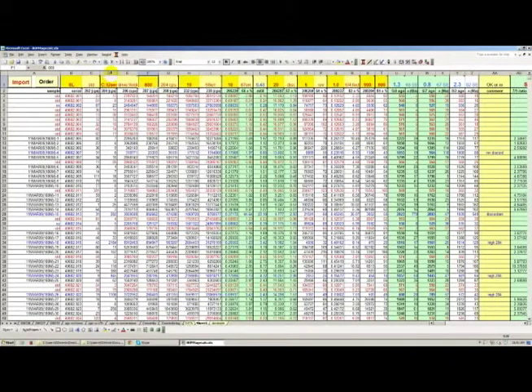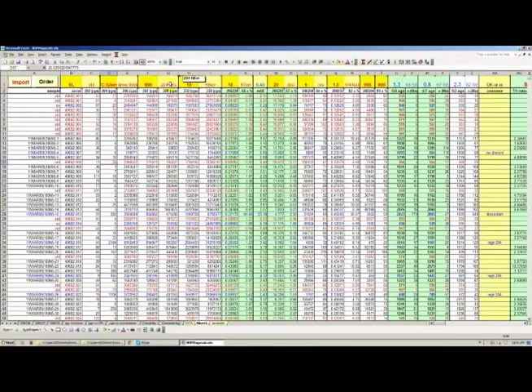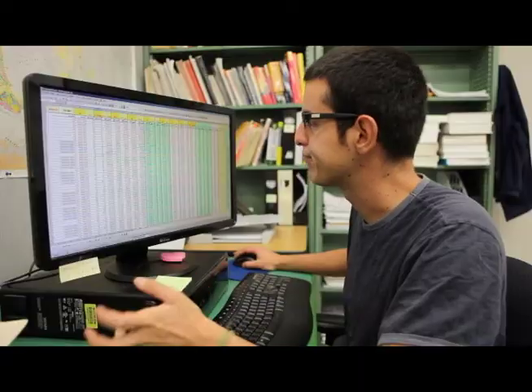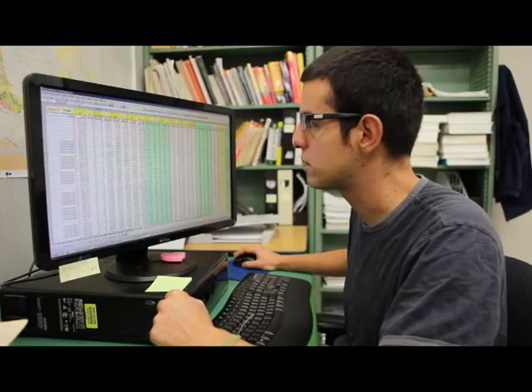And you can see down here, if you look at column D, that these values are usually pretty low. So in most zircons, and especially if you look at your Sri Lanka standards, you'll see that they average 10, 20, and for the most part they stay pretty low also in the unknowns. But then every now and then there are some grains that have a significantly higher 204 concentration. So this first filter is going to highlight those grains that have 204 concentrations that are higher than 600 counts per second.